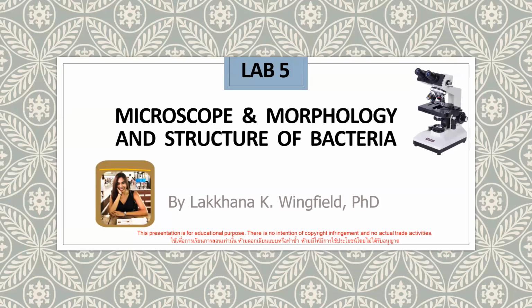Hello, welcome to Practical number 5, which is about the microscope and the morphology and structure of bacteria, taught by Ajahn Lakhana Kanhayiwa Wingfield.